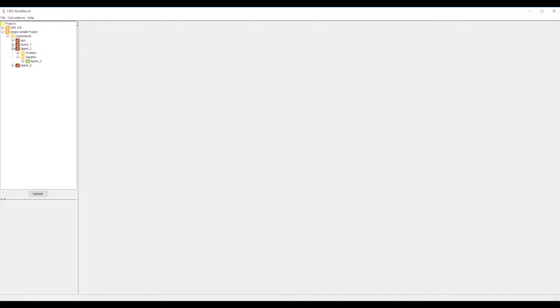Okay, so initially we will go back into the apo dataset, and let's look at the results of the T0 search. So we have our grid.